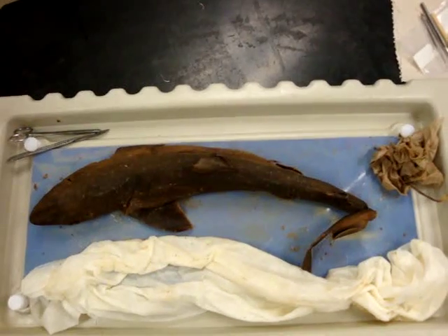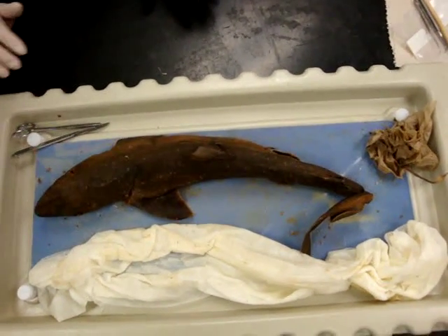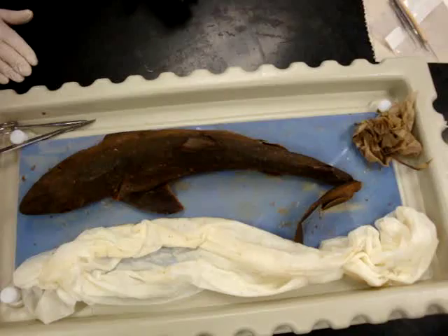This is a dogfish shark. It's kingdom Animalia, phylum Chordata, subphylum Vertebrata, superclass Gnathostomata, class Chondrichthyes.